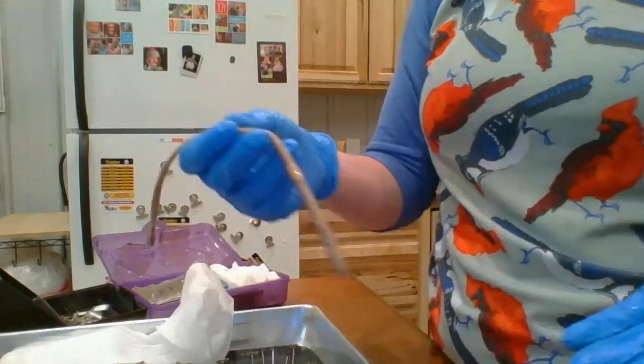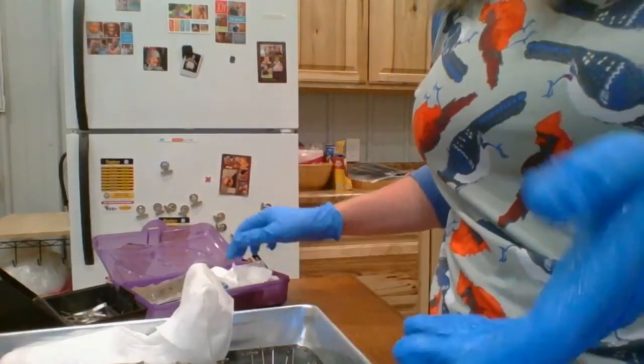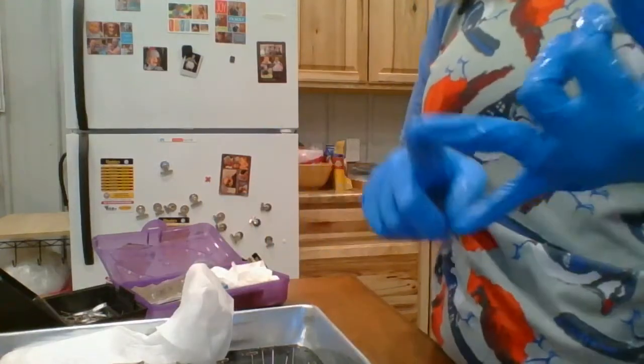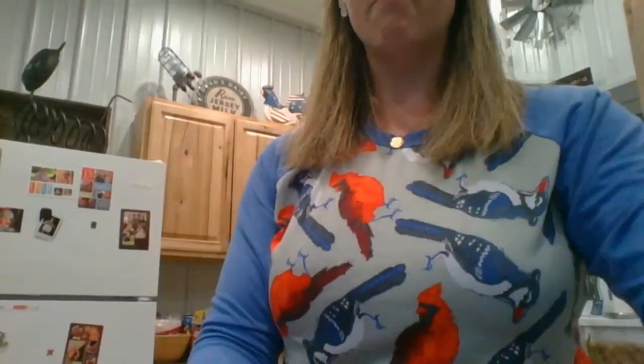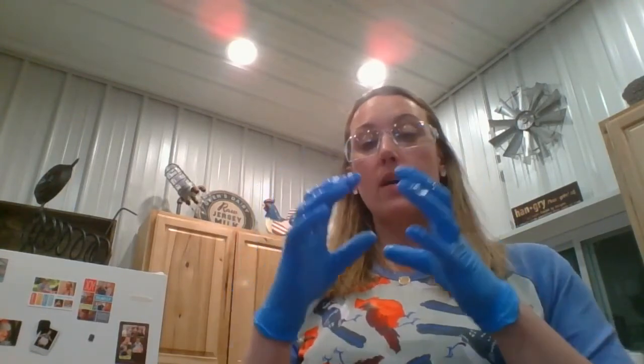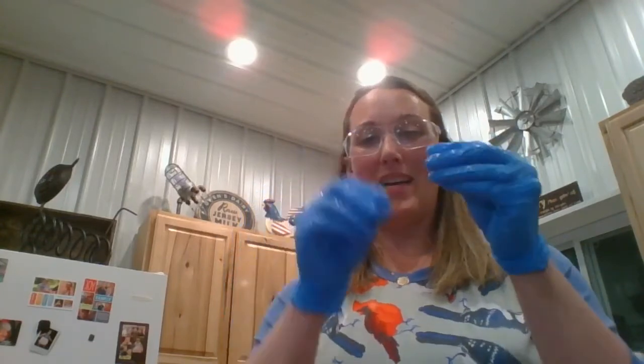On the inside, it has those seminal vesicles, which are currently in my paper towel. Kind of gross. It has the aortic arches. There are 5 aortic arches. It has the pharynx, which is the muscle from the mouth connecting the mouth to the esophagus. It has the crop, the gizzard, the intestine, and the septa. The septa is once again what's going to hold the organs to the outside layer of skin. Those are the things that I had to tear as I was cutting through the worm.